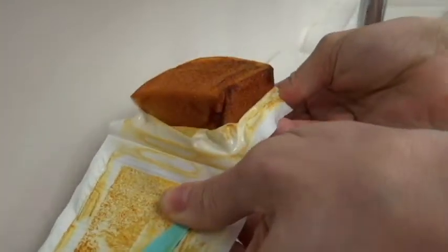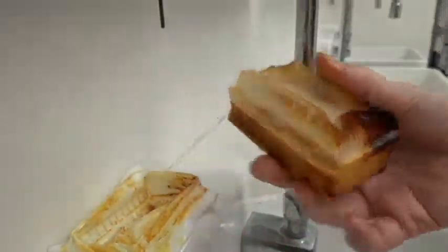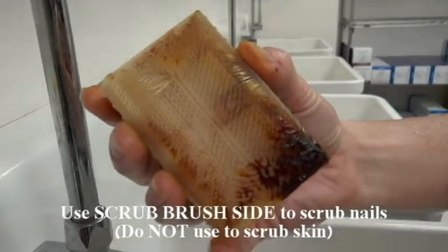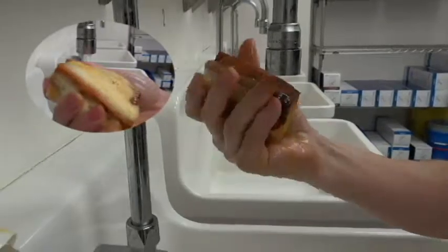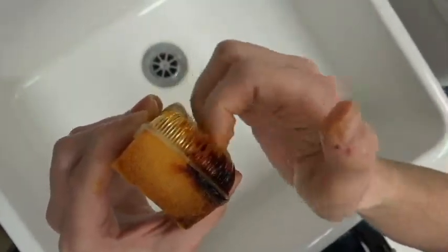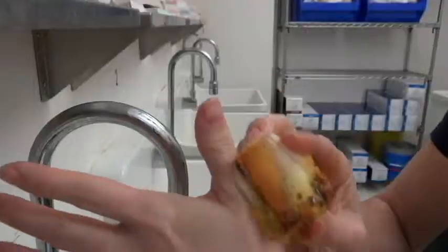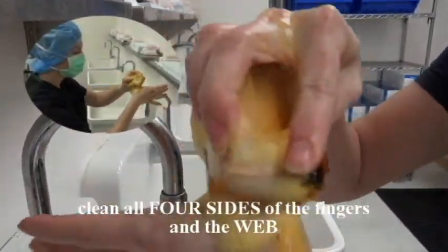Remove soap sponge from the wrapper. Be sure to use the scrub brush side with the bristles to scrub your nails. Do not use this to scrub your skin. Wet soap scrub sponge with water and gently squeeze to lather. Utilizing the brush side, scrub your nails and fingertips. Use the soft sponge side to scrub the skin. Scrub all four sides of each finger including the webbing, starting with your thumb.